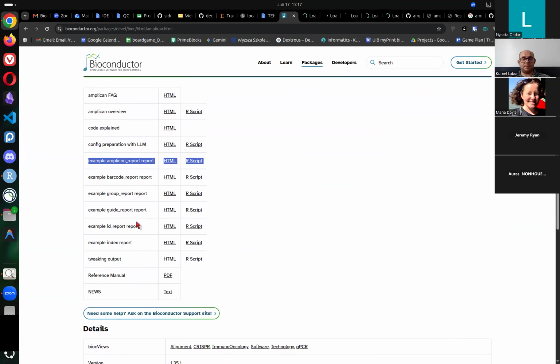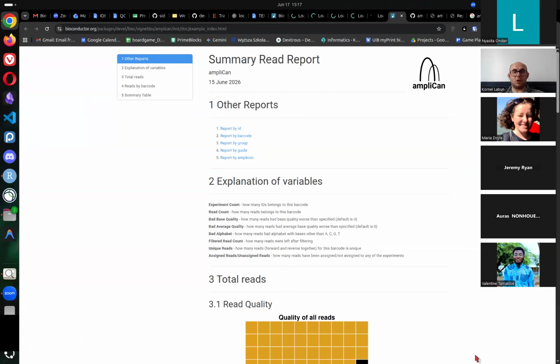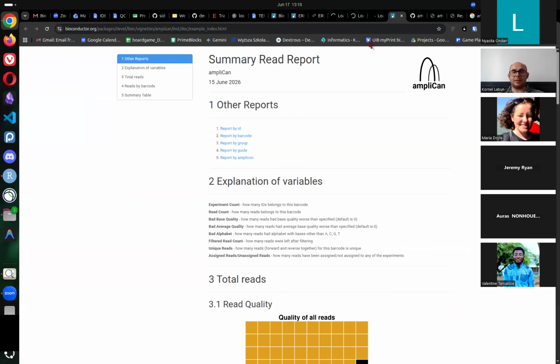The ones here are example reports. These are the default reports that, if you run ampliCan on examples, this is what you're gonna see. They are copied over as vignettes. So we can open this report and take a look at what ampliCan is giving us at the end of the day. This is like a summary. We're gonna have all kinds of plots and links to other reports. So we can click that and see by ID, for example, this report.